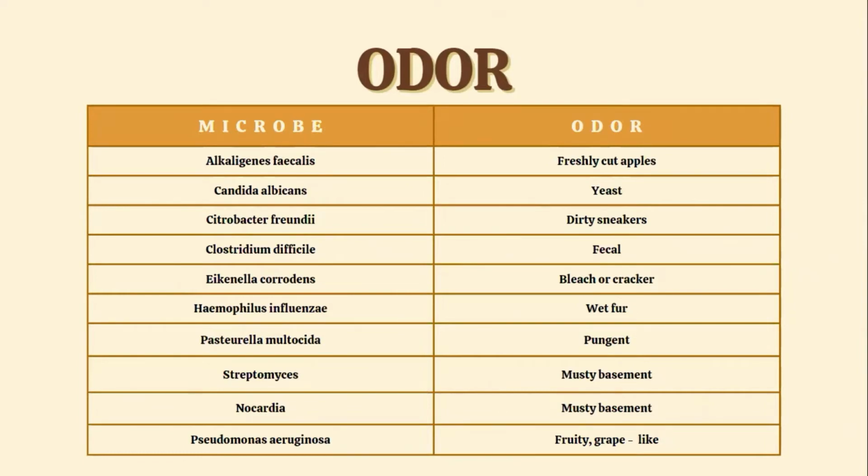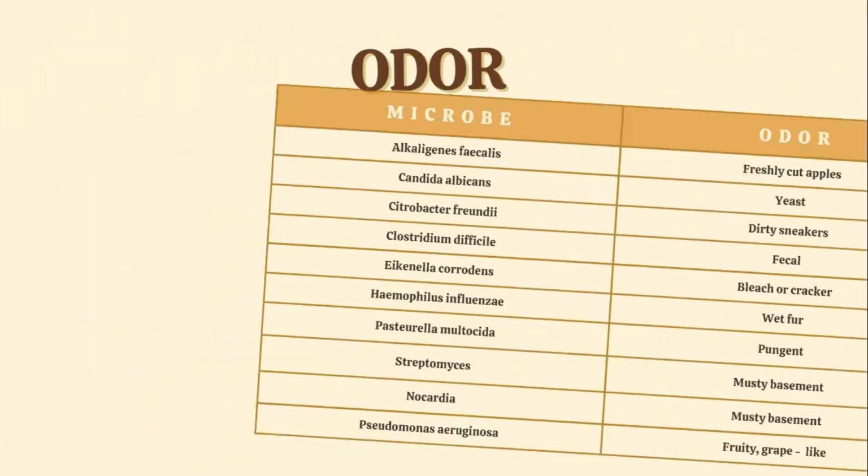Haemophilus influenzae smells like wet fur. Pasteurella multocida is pungent. Streptomyces smells like a musty basement, as well as Nocardia. Pseudomonas aeruginosa has a fruity, grape-like odor.